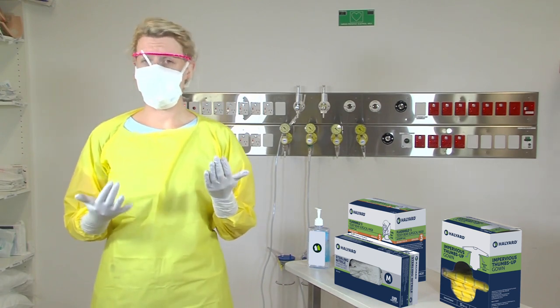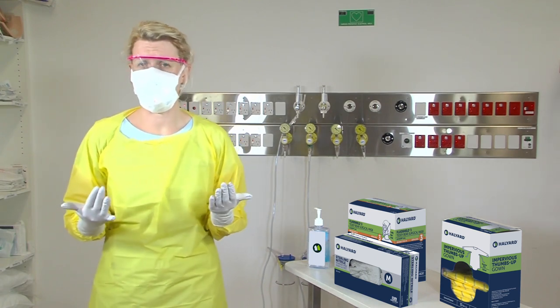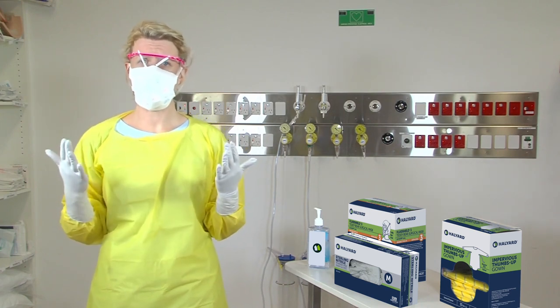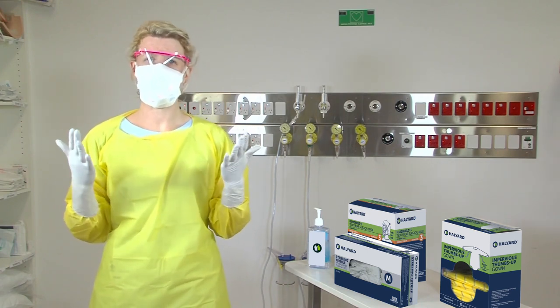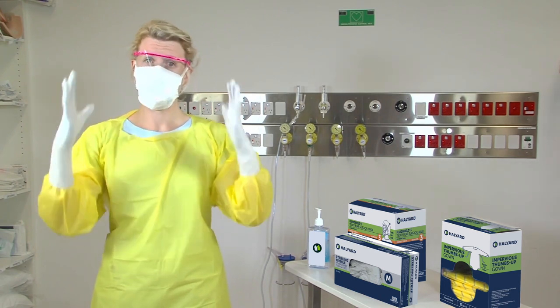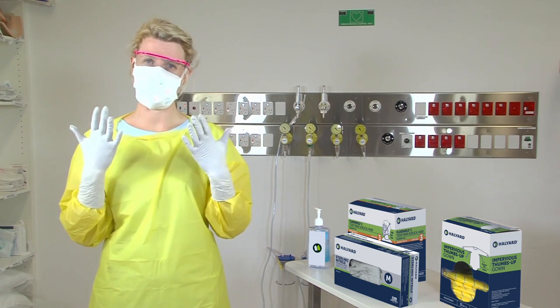Finally, before you go in to see your patient or perform your procedure, stop and check that you have all equipment applied — applied properly, thoroughly, and in the correct sequence. Remember: body first, face second, hands last.